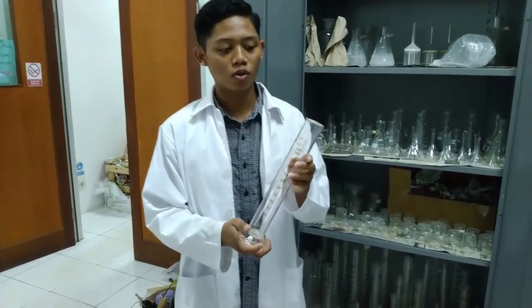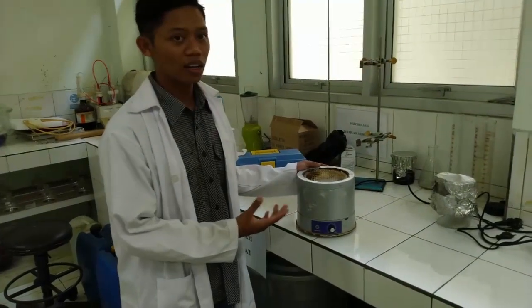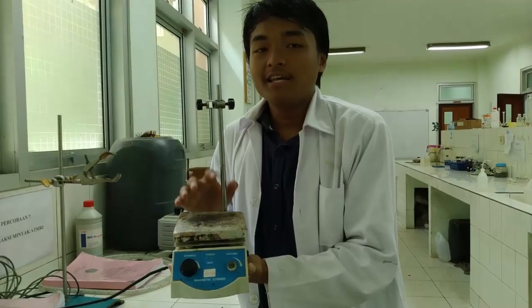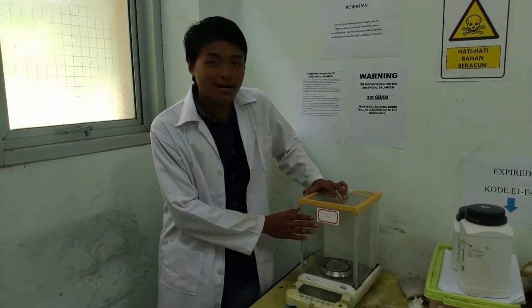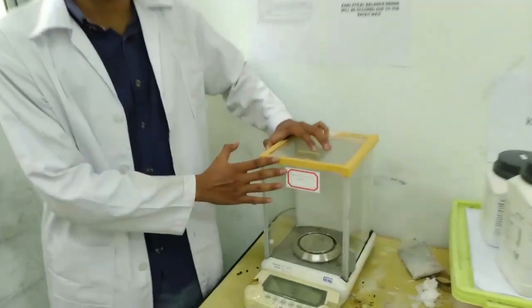Gelas ukur 250 ml digunakan untuk mengukur volume hasil ekstraksi yang dihasilkan dari proses ekstraksi tersebut. Ada ismantel yang digunakan untuk memanaskan labu. Ini adalah hot tank yang akan digunakan untuk mengeringkan bahan. Ini adalah neraca analitik yang akan digunakan untuk menimbang bahan ekstraksi sebelum dan sesudah ekstraksi.